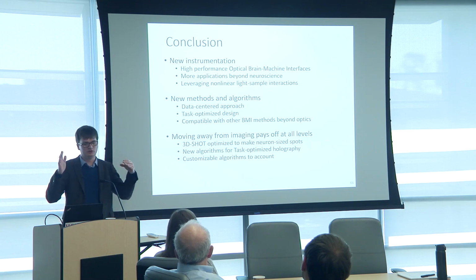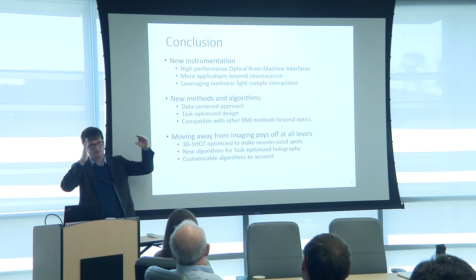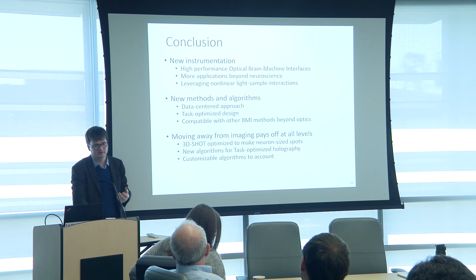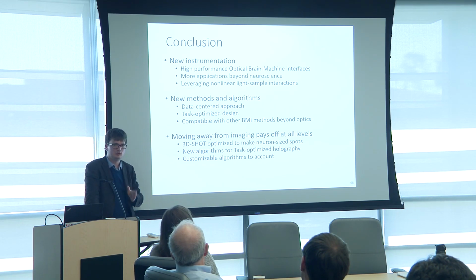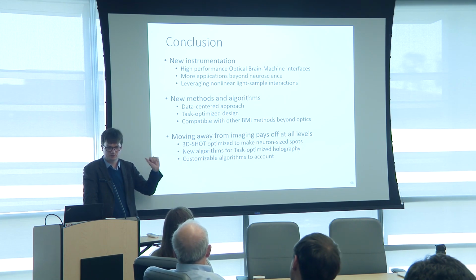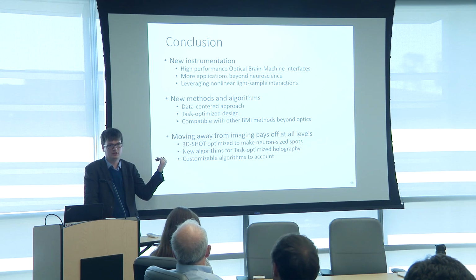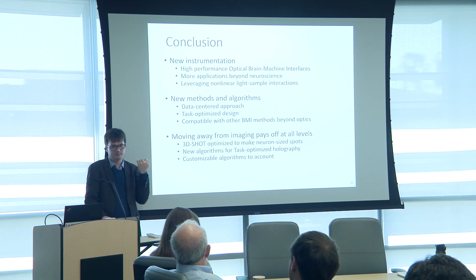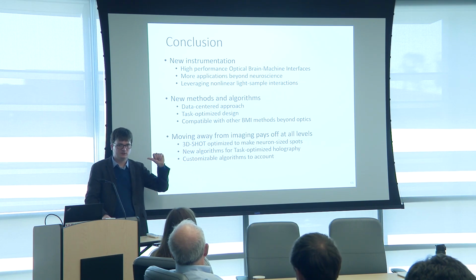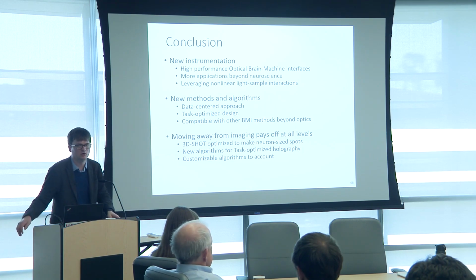The main technique we employ is we shoot the light at the SLM at a shallow angle, and we get the beam that comes back. There is a way to play with polarization and quarter wave plates that allows you to be straight on the SLM. You hit the SLM with one polarization, pass twice through the same quarter wave plate, and rotate the polarization, allowing you to collect the opposite polarization on the beam splitter. So you shoot the light through the beam splitter, it's transmissive. By the time it comes back to you, it's reflected. This is a simple trick to go around that problem.